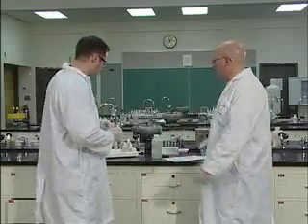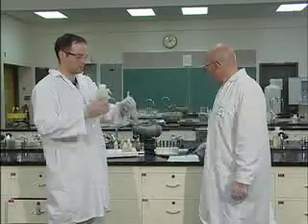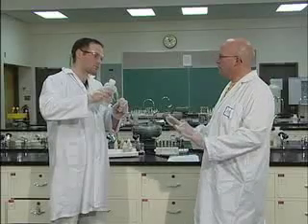Okay, good. Well, so let's do our composition one. So composition, what you're going to do is you're going to add distilled water. Notice how I've labeled this test tube A. You might want to label your test tubes the same way. It doesn't matter though. You're going to go through this step by step. Good idea to have a table sort of done beforehand, class.